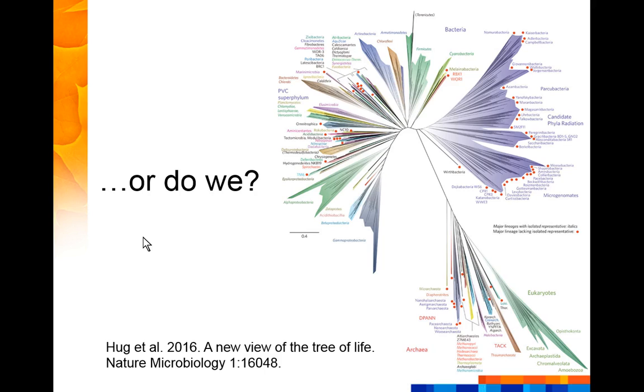All these unknown, uncharacterized bacterial phyla that were discovered by metagenomics, focusing on closing or making genomes from, I think this was from groundwater, very deep groundwater that they filtered through a filter with which you normally sterilize your samples.